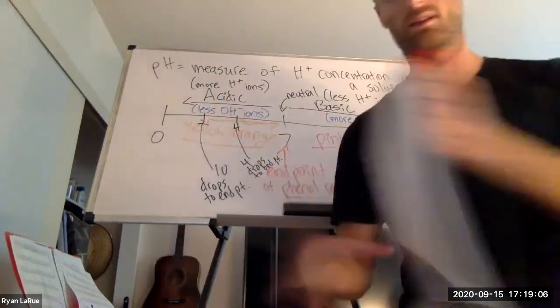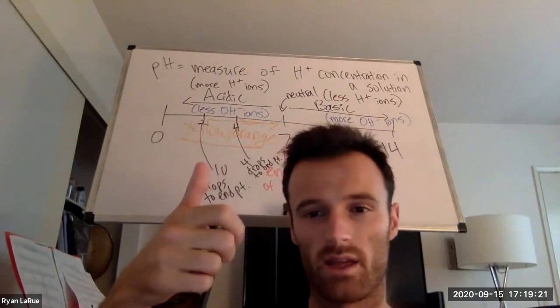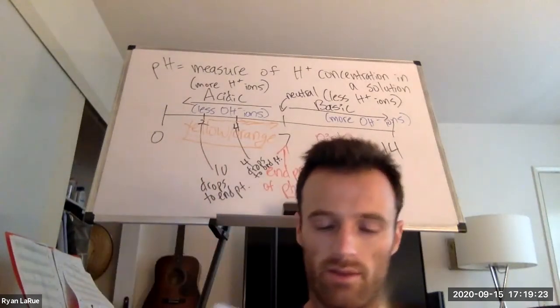So that's why in the data table you see saliva, gastric juice, all of them listed twice, because she does it twice. This is for accuracy, just to repeat it to see if you get the same, human error. You might have missed a drop or didn't count it, whatever. You take the average of the two for each one.